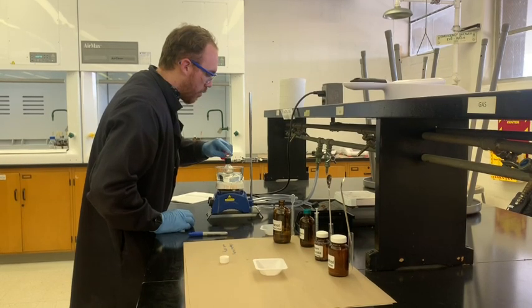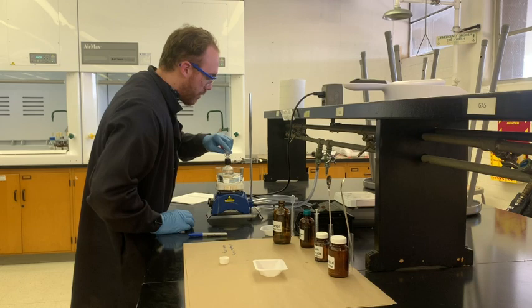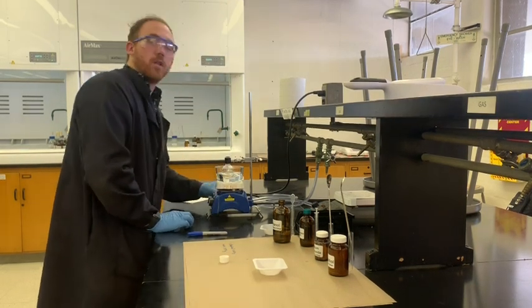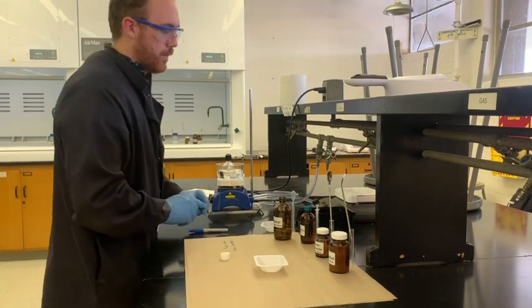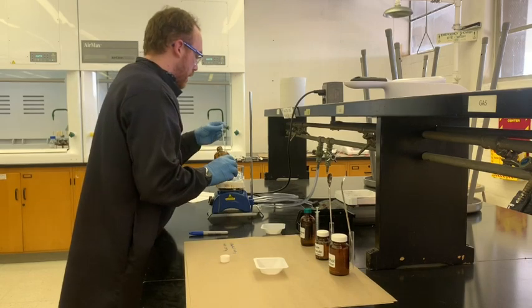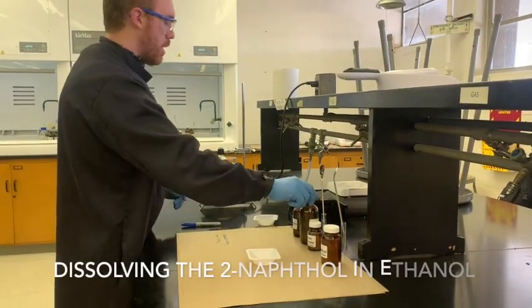Try to make sure that if you can, rinse off as much of the solid from the neck of the flask as possible. You don't want to lose any of the solid up in the neck. I'm going to use a little bit of this ethanol to give it another rinse because I think I lost a little more on the side.